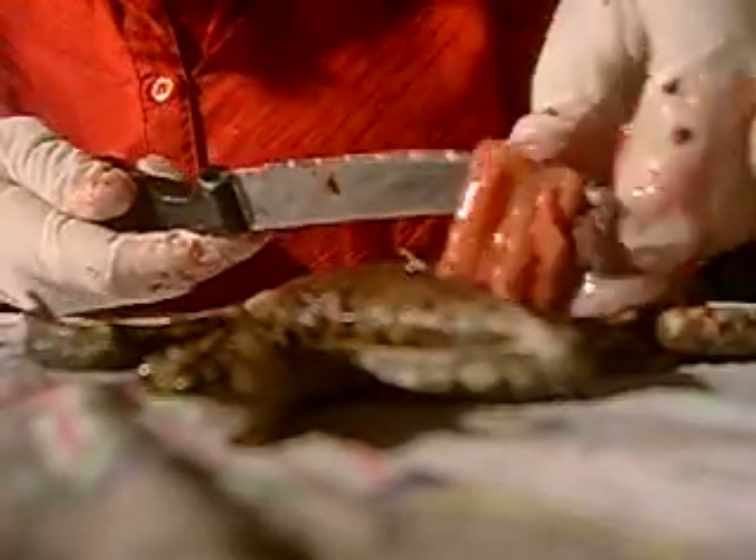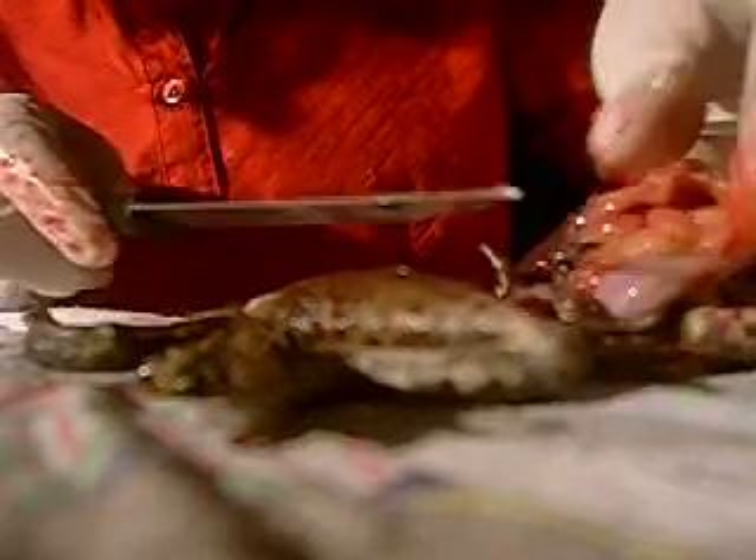What else is in here? It's all the food. Yuck, you can feel the food in it. It's gruesome.